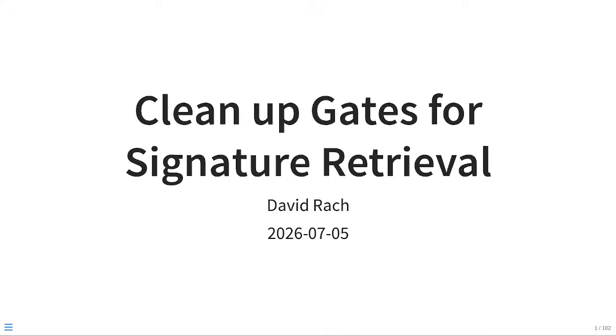Alright, so now that my slide deck is working, let's go ahead and get started. We're going to try this all over again.